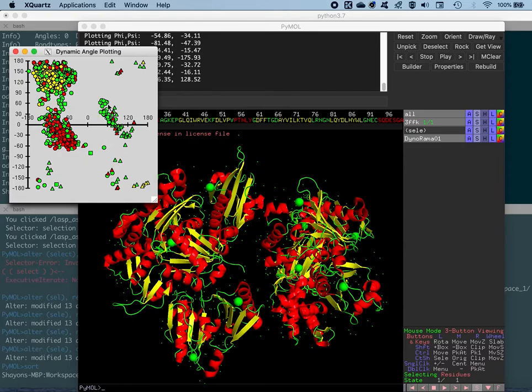You have some of the normal amino acid residues, apart from the glycine and proline, colored in green as well. So that means they belong to the loop region, and that's fine. And then you have the proline residues. In fact, all of them belong to the loop region, which is fascinating. And then you have this one that we showed just there while annotating it by right-clicking it. We found that it belonged to the beta sheet region. And this is a confirmation that this residue indeed belongs to the beta sheet region.